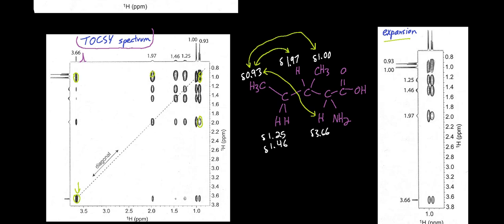And so what we're doing here is that if we had the TOCSY spectrum of that hypothetical complicated peptide, we would have a set of purple signals and a set of green signals, where the purple signals in all likelihood are going to overlap in this region here with the greens, but here they're distinctly separated.